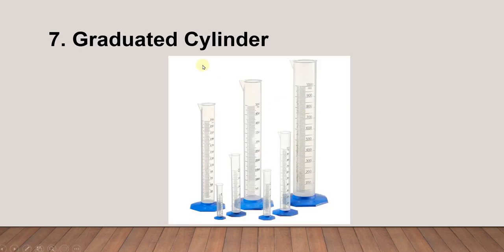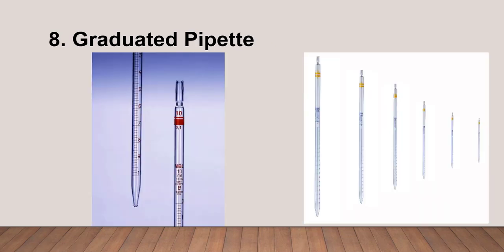Next is the graduated cylinder. You use this to transfer a large volume of solution. We can have different sizes, maybe from 5 ml up to 100 or 1000 ml. Next is the graduated pipette — the maximum in this case may be 10 ml. This pipette is more precise than the graduated cylinder, so if you want to transfer a precise volume you should use the graduated pipette.